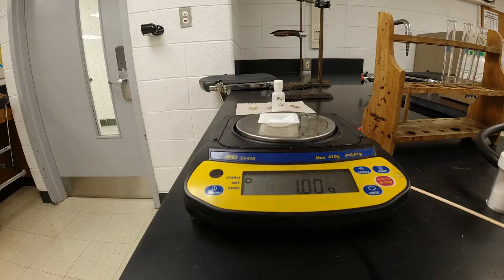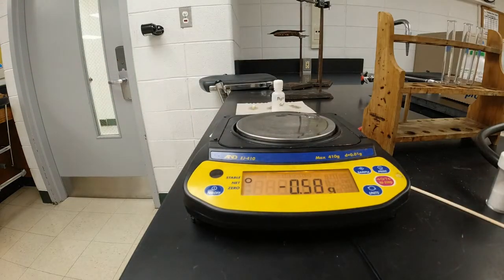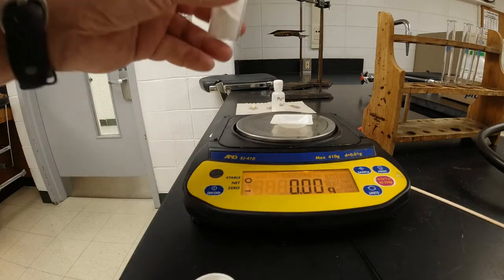And there we go. There's 1 gram. Okay, there's 1 gram of the magnesium sulfate. And now I'm going to weigh out 1 gram of the calcium sulfate.